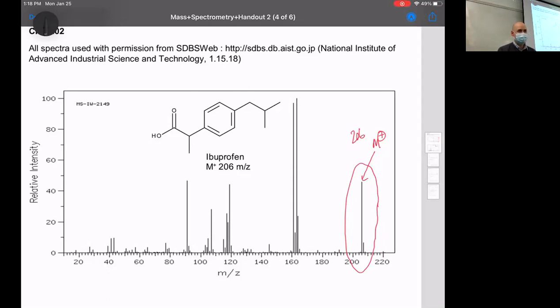All right, flashback like 3 minutes. What do you think these smaller mass ions are? Yeah, those are the fragments. So this is what we might call the fragmentation pattern for the molecule. You can try to figure out what those are if you want to. You can look at their mass and try to figure out, if you really love puzzles, where exactly what chunks of this molecule fell apart to give you that. We are not going to focus on that, and I am never going to ask you to do that.